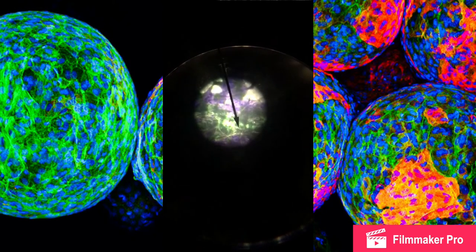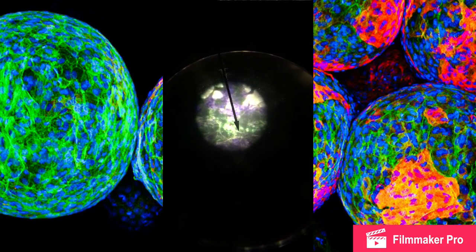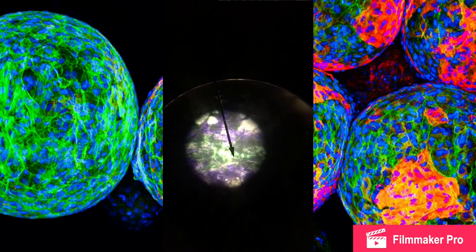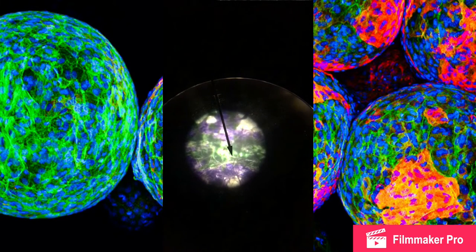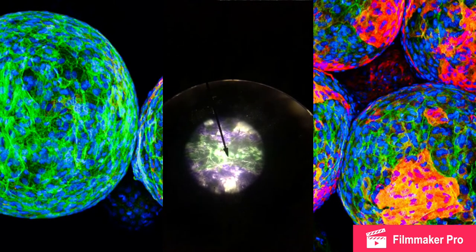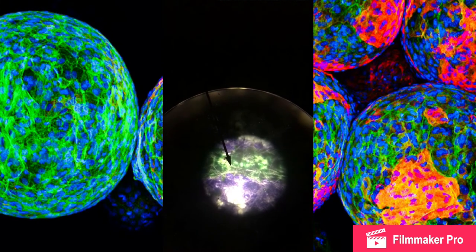There, I have it where I want it. Wow, that looks weird—looks like scratches or something. Green and purple scratches, to be precise, or scratches in blue, green, and purple.